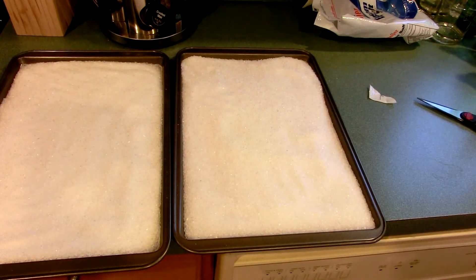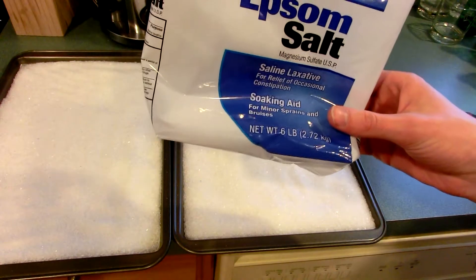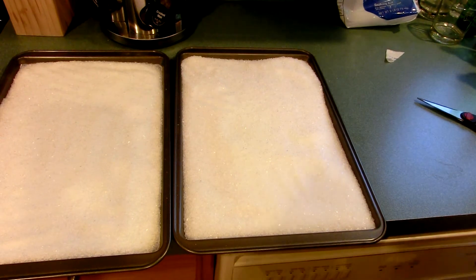So there we go, we've got the magnesium sulfate spread evenly across those pans. This was a 2.72 kilogram package; it's going to make quite a lot of desiccant — for me, almost a lifetime supply. That'll be very nice.